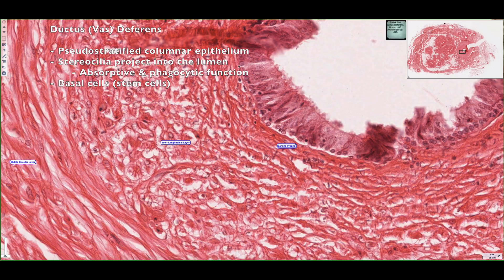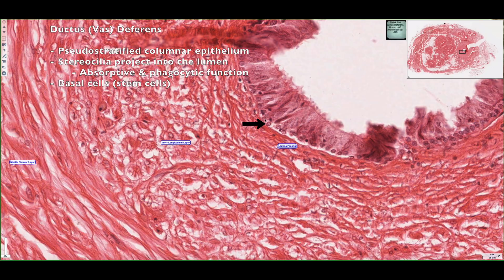Around this basement membrane, we can see a layer of basal cells, which are essentially stem cells that are going to help rejuvenate and replenish the cells in the pseudo-stratified layer as they become damaged over time. So lining this duct, we have basal cells, pseudo-stratified epithelium, and stereocilia that project into the lumen.